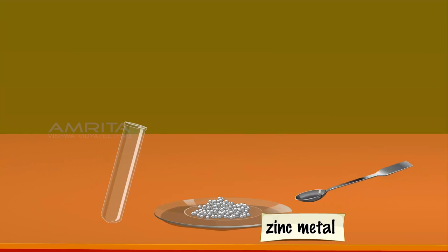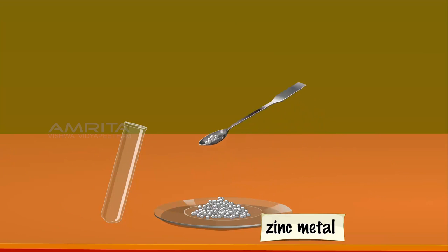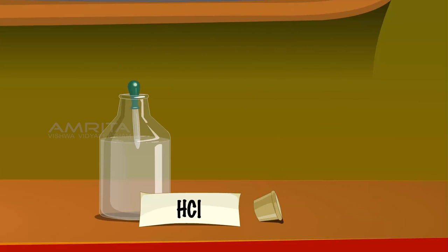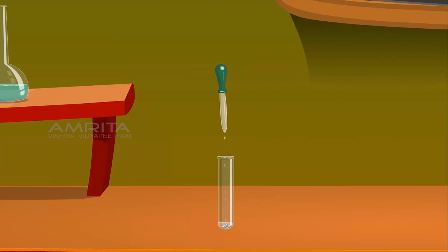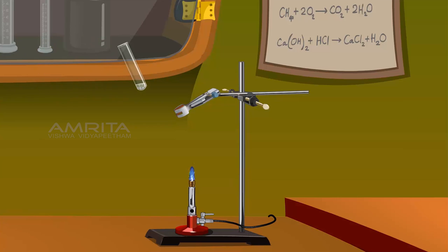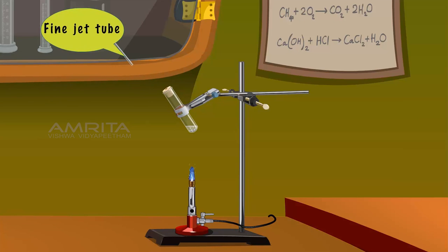Using the spatula, transfer some of the zinc metal from the dish into the test tube. Take a few drops of the HCl solution from its bottle using the dropper and add this to the test tube containing the zinc metal. Clamp the test tube to the stand, then close the mouth of the test tube with the cork and pass the jet tube through the hole in the cork into the test tube.